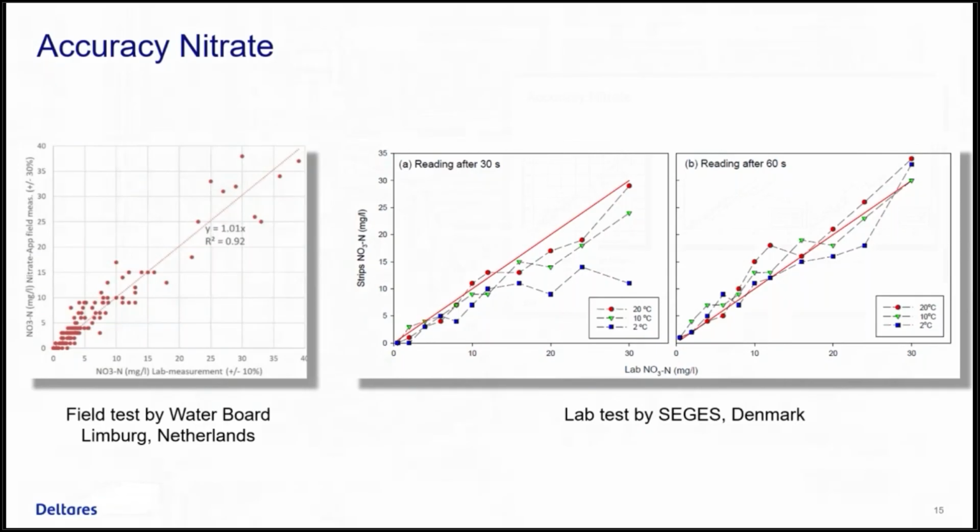And these are actually some testing results done on the left side by the Water Board Limburg. So they took samples in the field for analysis in the laboratory, but they also in the field did Aquality App measurements. And they found a good agreement between the two.